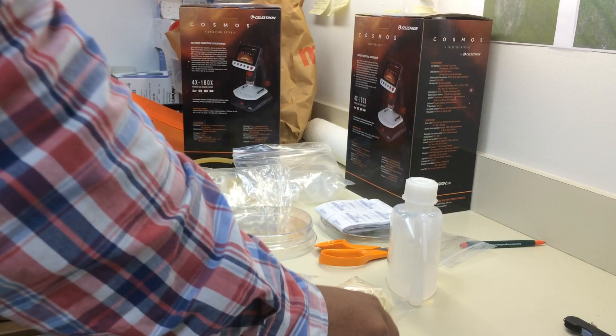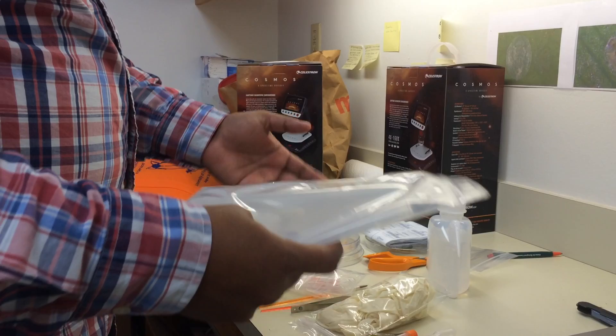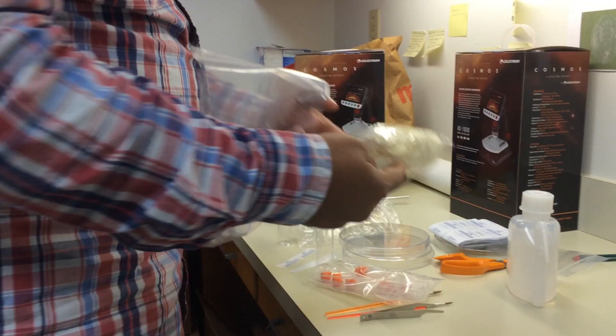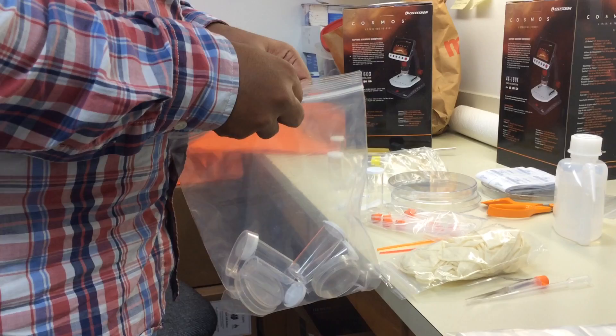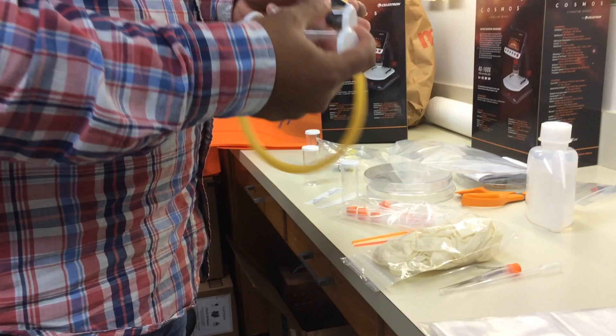We also have ziploc bags in the kit to collect leaves or samples from the field and bring them to the lab. We have also provided eight pairs of gloves so you can start sampling right away. If you need more gloves, you can ask us or buy your own. There are also extra vials to help you collect multiple samples from various locations in one field trip.